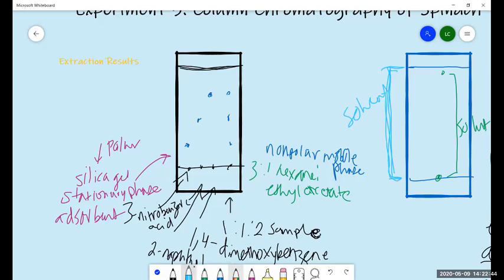But this might not always be the case, and you might have residue. For instance, I could have residue here or here, and if I had these 3 spots, I know, oh, of course I didn't separate out just 2-naphthol. I have 2 other components. How concentrated the spot is, how dark it is, kind of tells you how much you have, but that's not easy to note. So it's kind of qualitative in that sense.